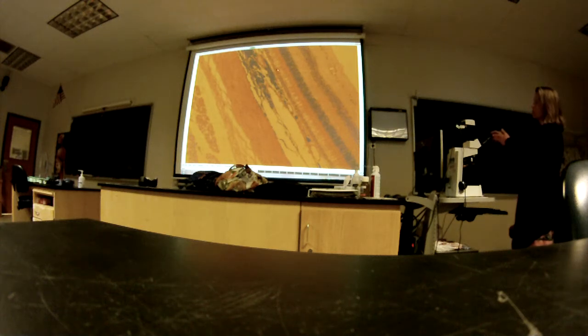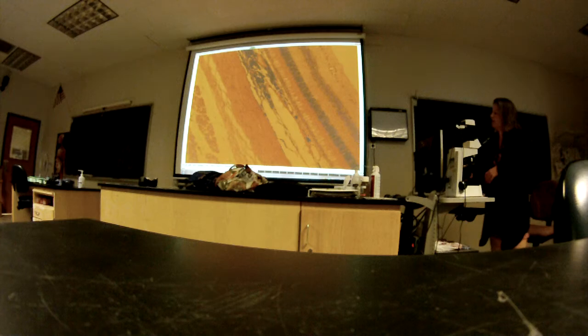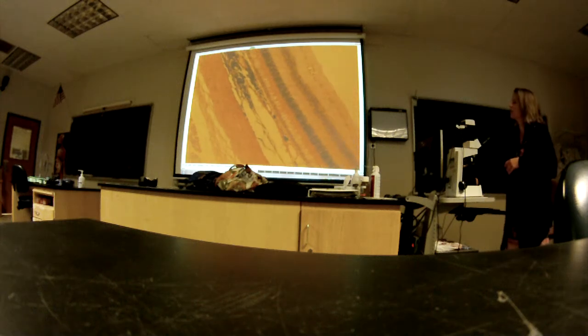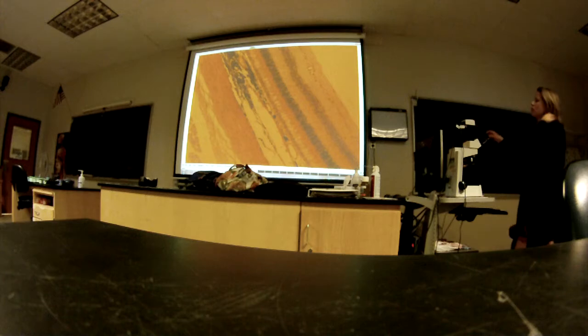That's the sublayer right here? Pigmented of the retina. Yeah, it's just the pigmented layer, or you could say pigmented epithelium. What does it say in here? It says pigmented layer, or pigmented sublayer. Okay, and then all the rest of these are, well, I guess there's multiple sublayers.